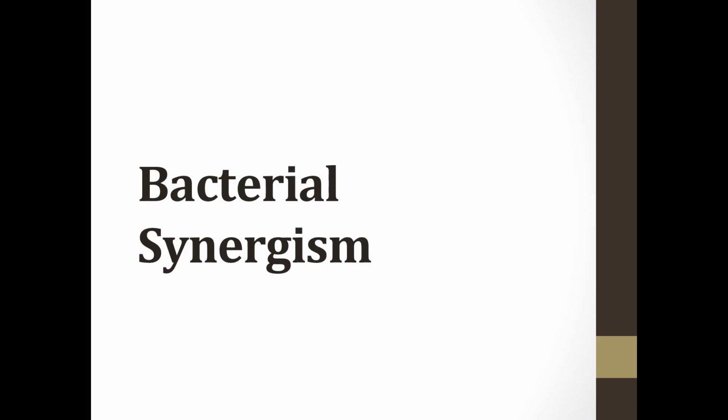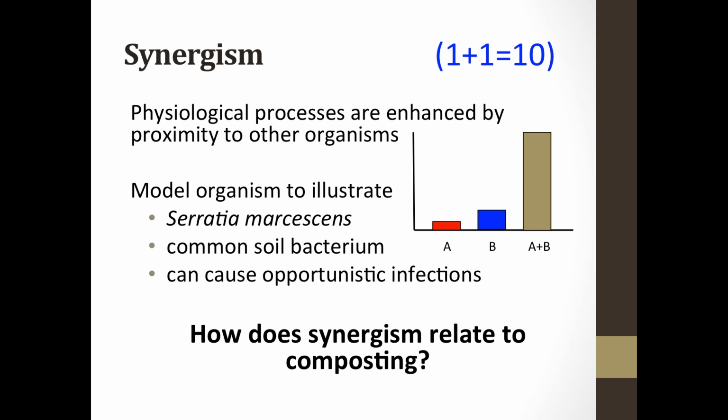Okay, this is the introductory material for the second part of Lab 3. So this covers the bacterial synergism portion of the lab. And this is for Thursday makeup labs that missed because of our snow day. We're going to talk a little bit about the bacterial synergism, and then you're going to discuss with your TA the experimental design for this experiment.